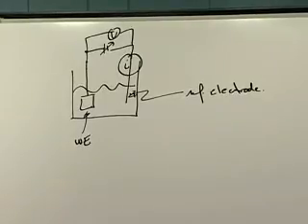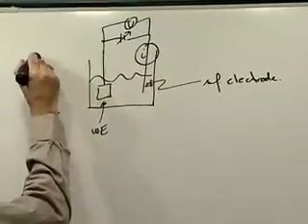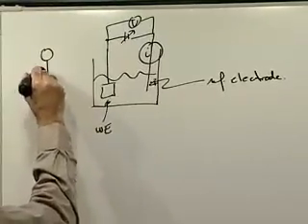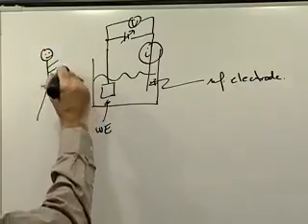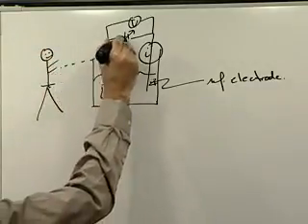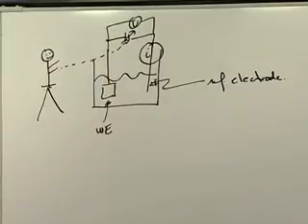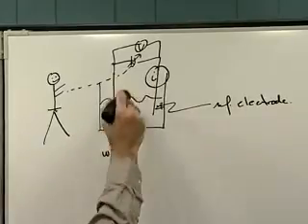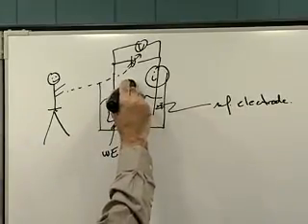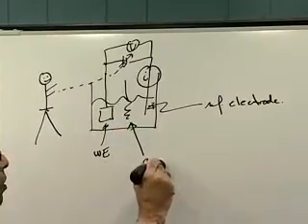Okay. We have our stool and our helpful freshman smiling, whose job it is to turn this knob to maintain that voltage constant, right? And now here's the change we're going to make. We're going to add a third electrode, which is the auxiliary or counter electrode.